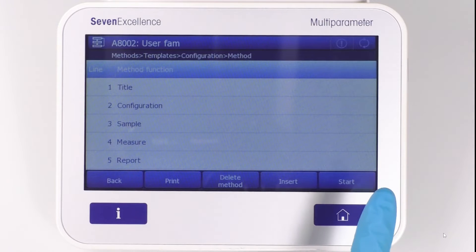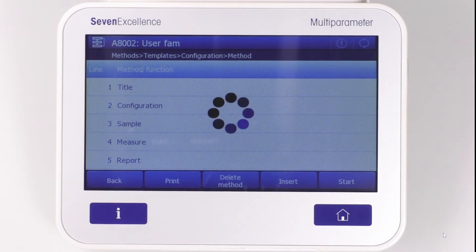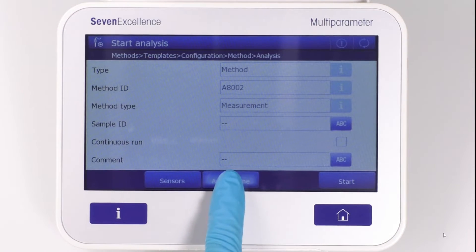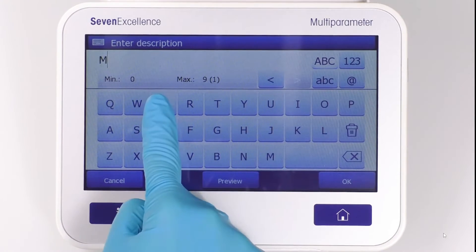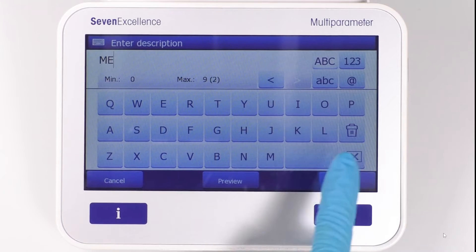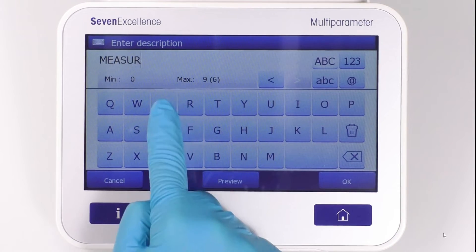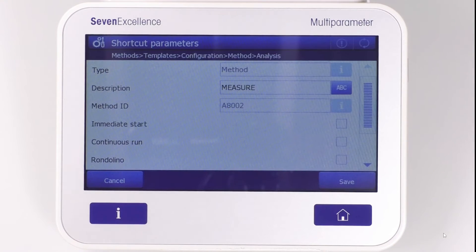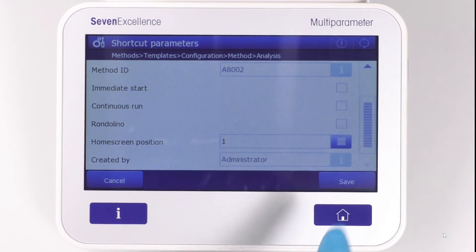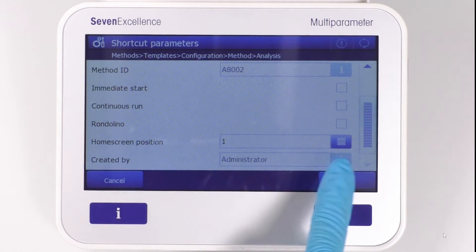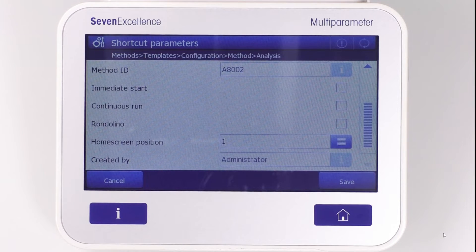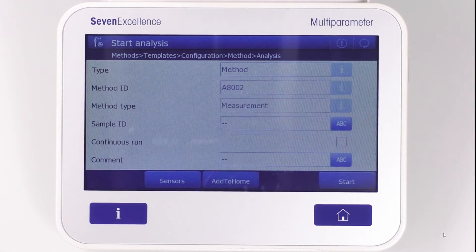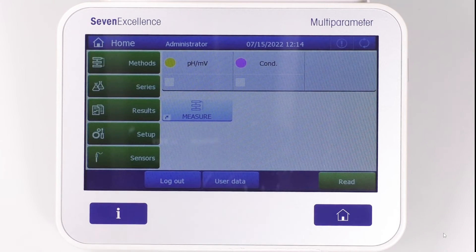To do that, you enter the desired method, press Start and Add to Home. Afterwards, the name of the shortcut as well as other parameters are entered, and the position on the screen is chosen. Once the shortcut is saved, the method can be started from the home screen using the one-click principle.